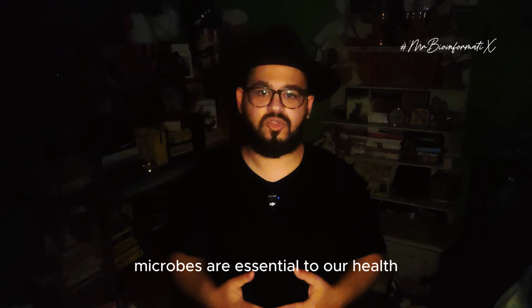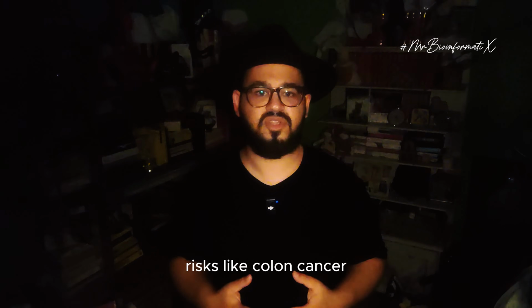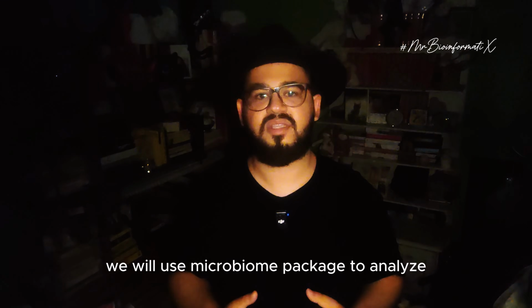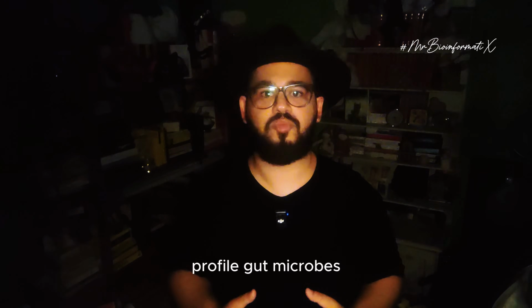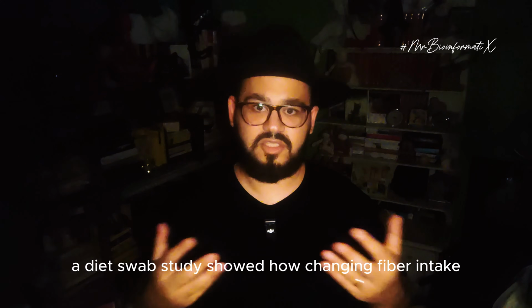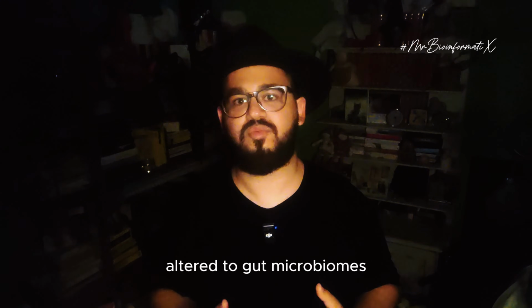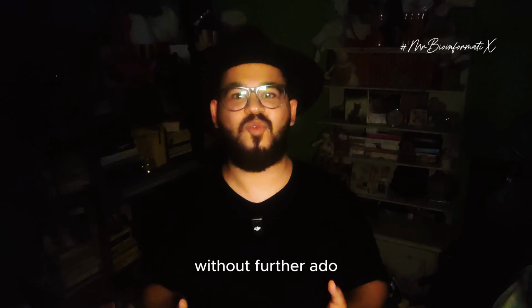Microbes are essential to our health, and studying them helps us understand disease risks like colon cancer. We will use the microbiome package to analyze 16S rRNA gene data and profile gut microbes, particularly focusing on their role in colon cancer risk, influenced by diet. A diet swap study showed how a change in fiber intake altered the gut microbiomes in African Americans and Africans. Without further ado, let's get started.